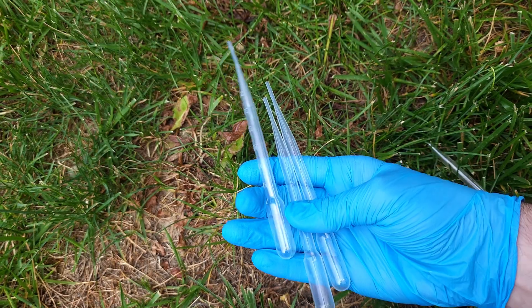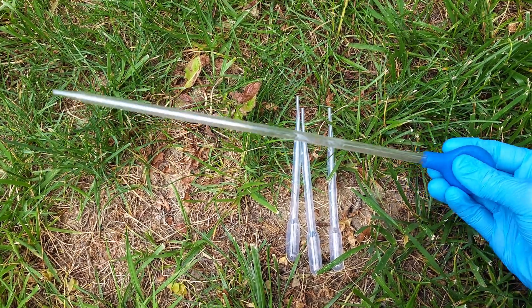You're also going to need pipettes to get some of these microbes, but you can also just use the jar itself to collect your water.